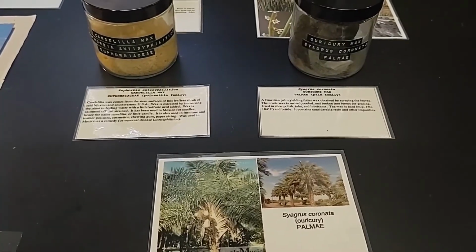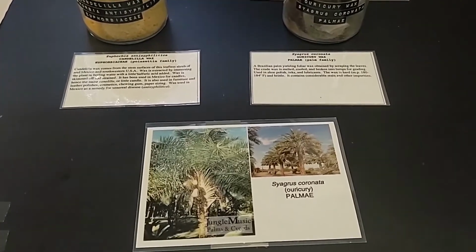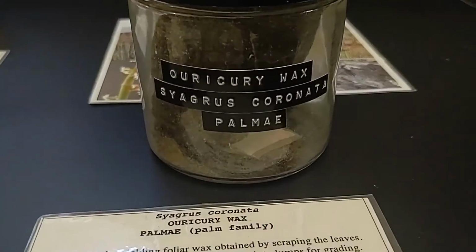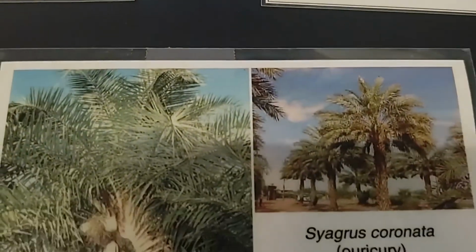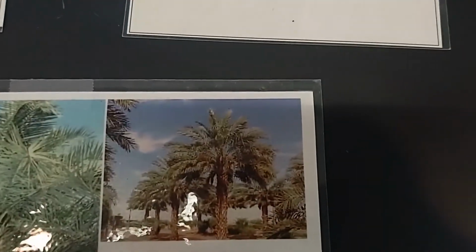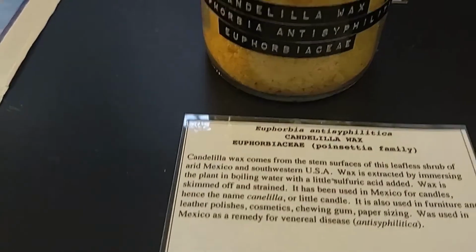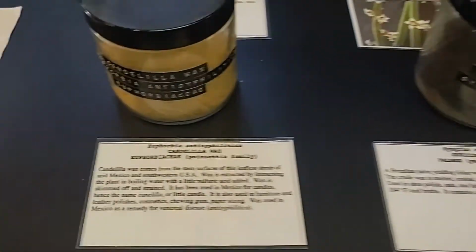Here I actually have two different waxes that are derived from palms. So we have the orikuri, which is right here, and also shown there. We also have here, oh I'm sorry, only one palm, like that.